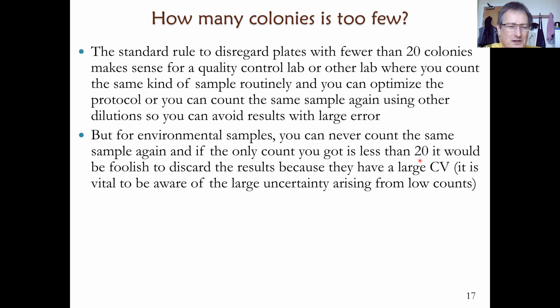Actually, many people take the log values of CFU counts and then average the log values. If you're averaging log values, what you're actually doing is taking the geometric mean of the counts, because the arithmetic mean of the log of the counts is the same as the geometric mean of the counts itself.